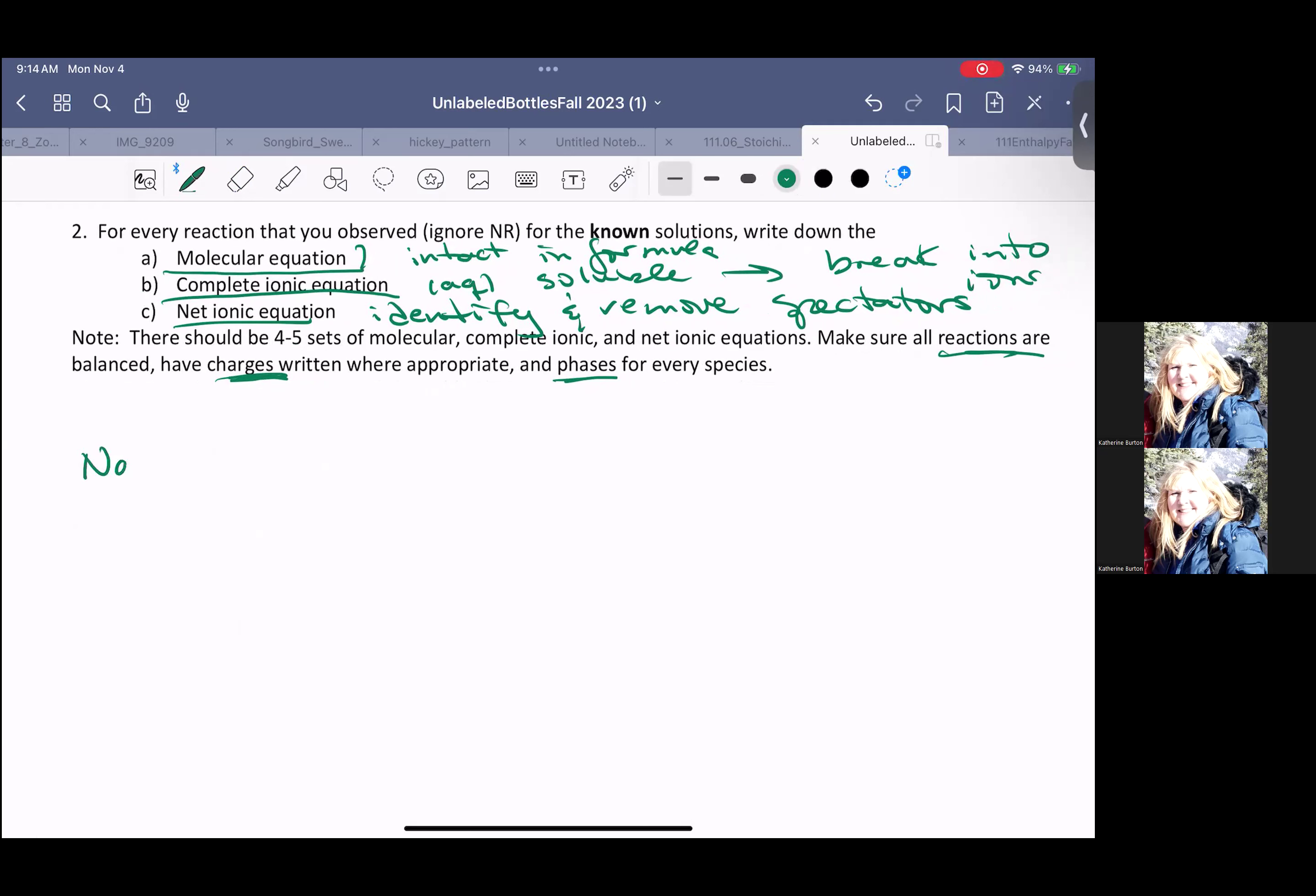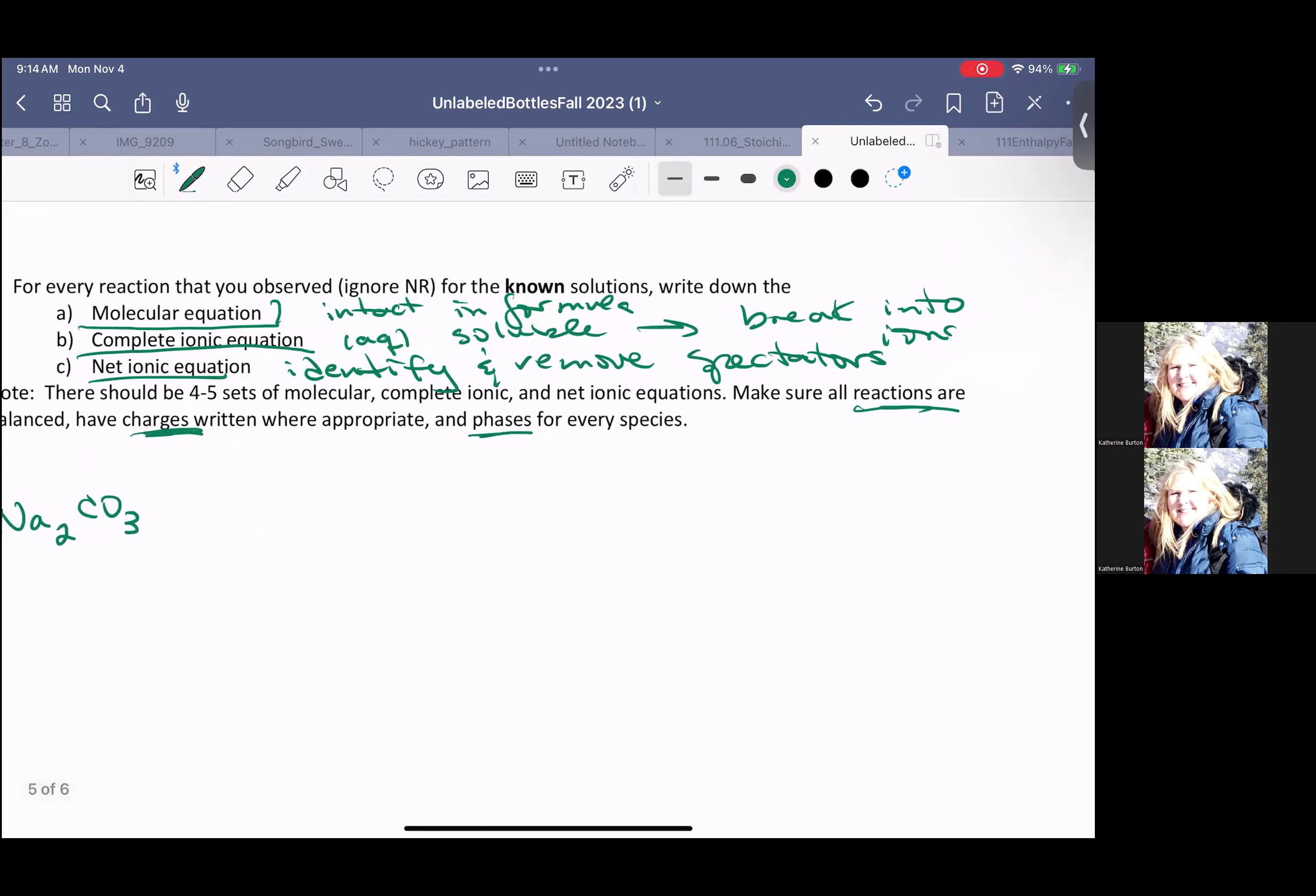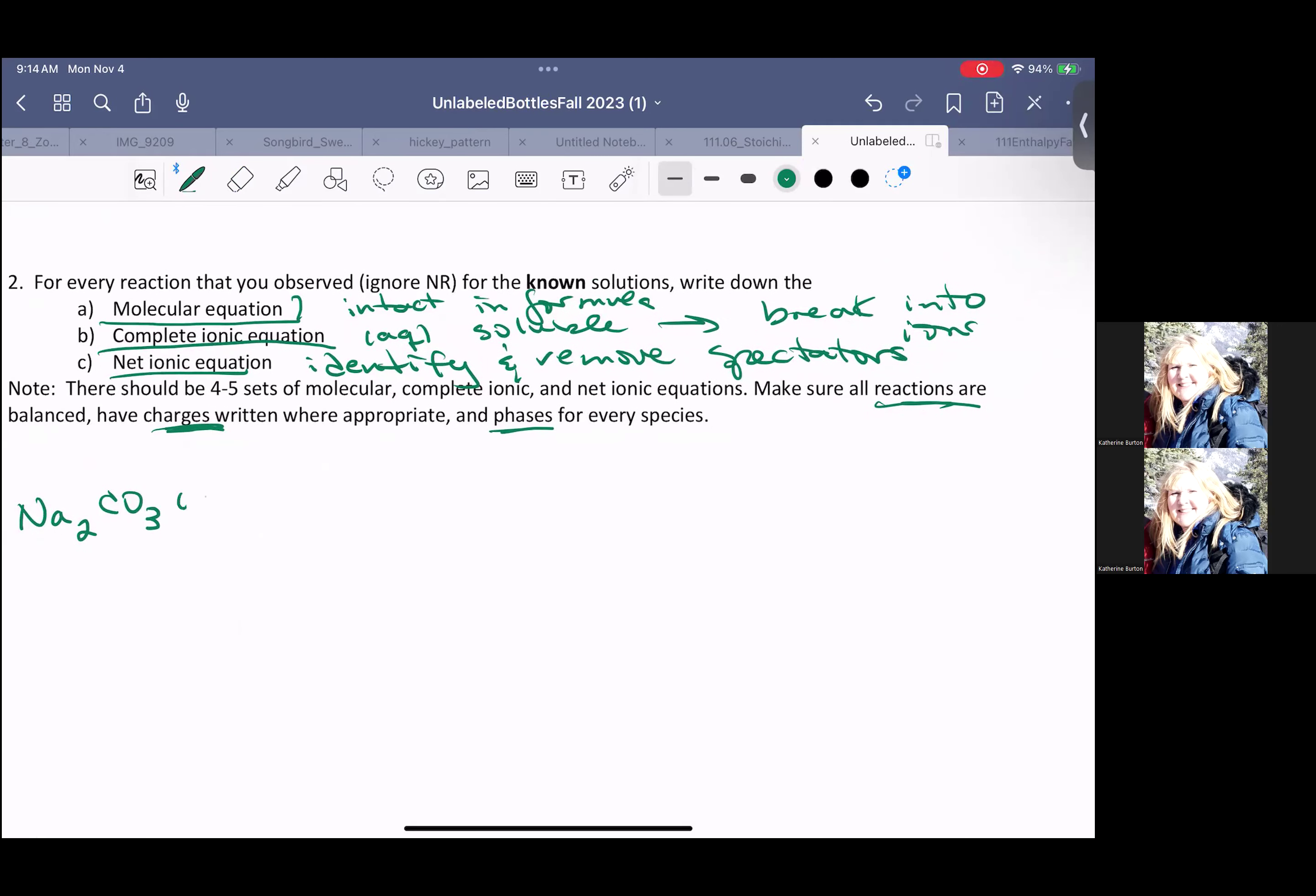We know from our solubility rules that all compounds that contain sodium are soluble. So we're going to put an AQ there, and it is soluble in water. We're going to react it with calcium chloride.